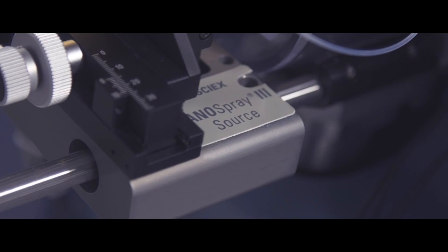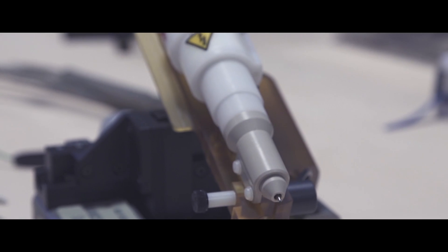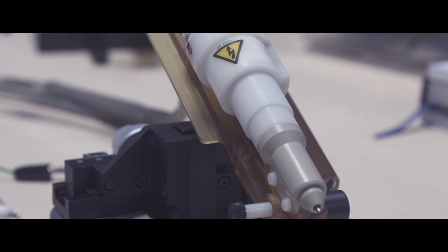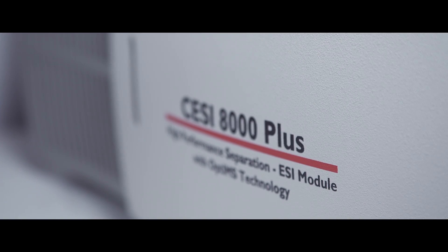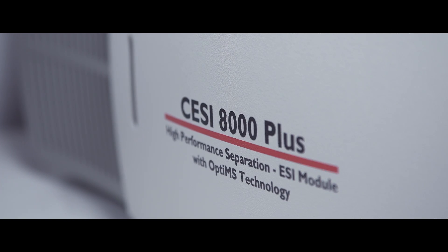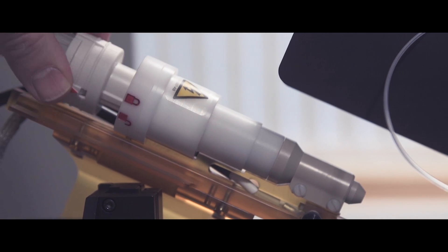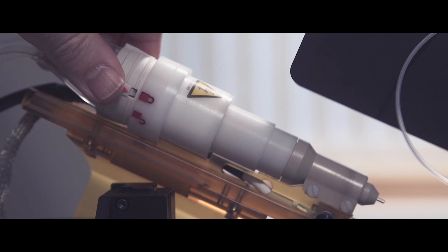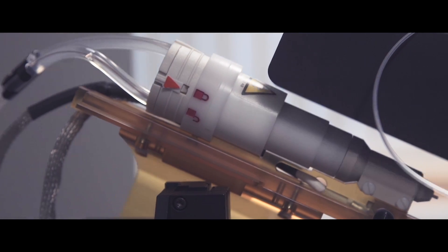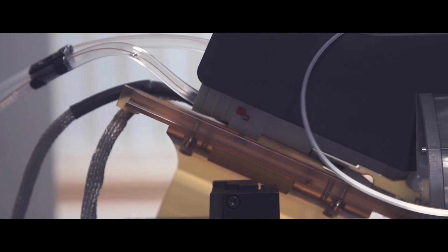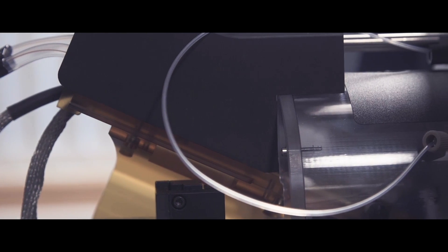With CSI there's none of these connections. The capillary you use for the separation is actually your sprayer tip as well. So all you physically do is put in the OptiMS cartridge into the holder and you're done, you're connected to a mass spec and it's as easy as that.